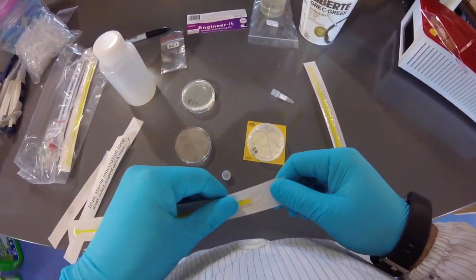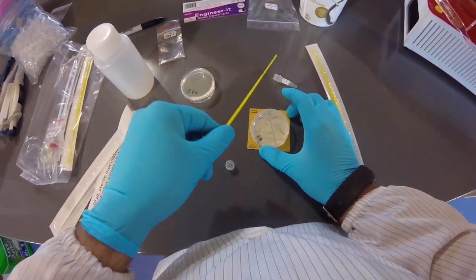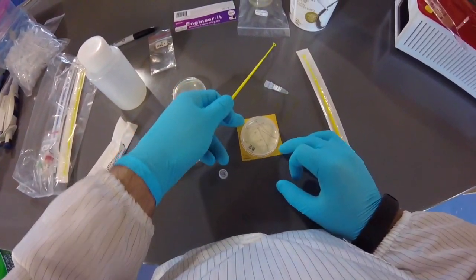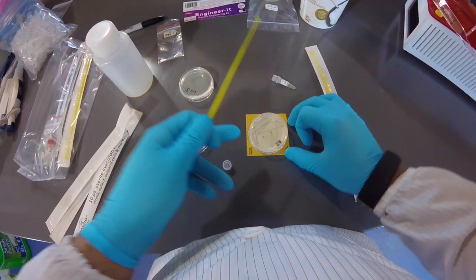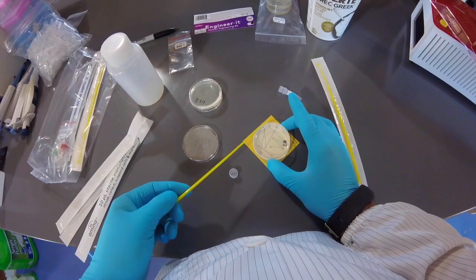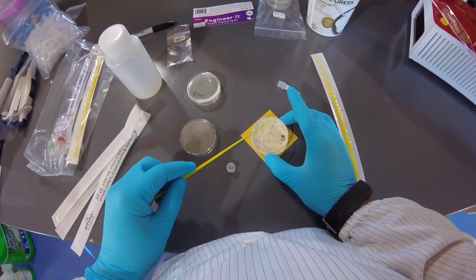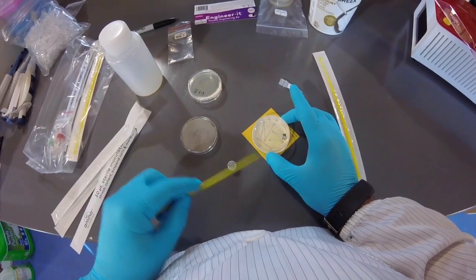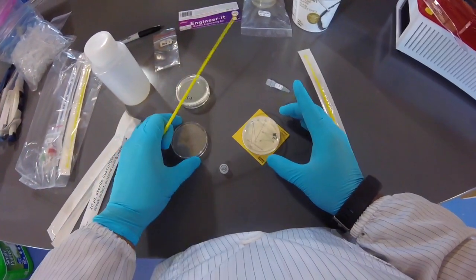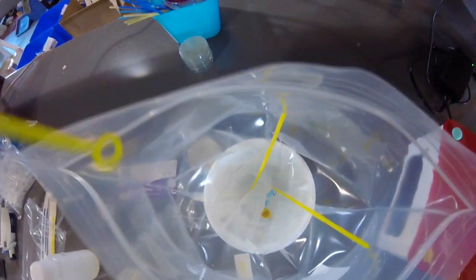Now I'm going to get another clean loop, and again, I'm not dipping the loop in again for the second and third time, okay? Because if I did, then I would have lots of cells on here again, and it would defeat the purpose of trying to get less and less, right? So same thing here, I'm just going to drag through and do a little zigzag there, okay? Done. Put my lid on, put this back in the inactivation bag.